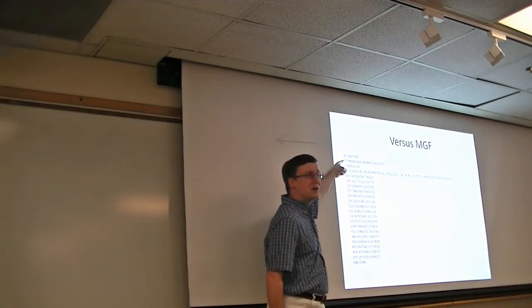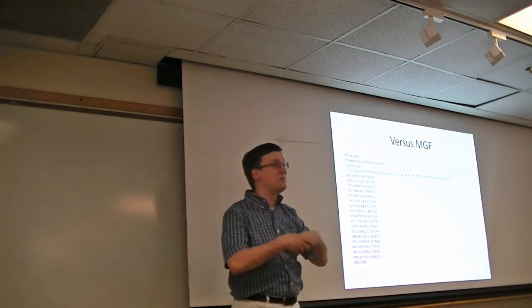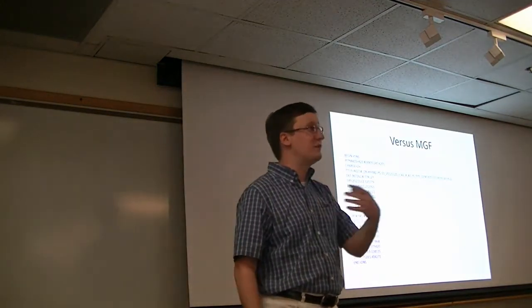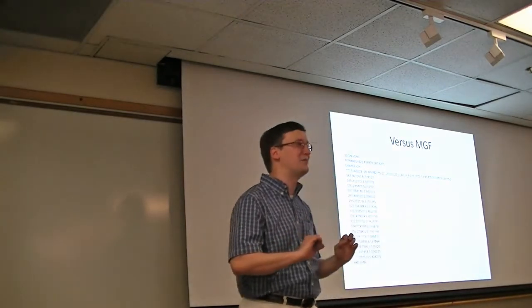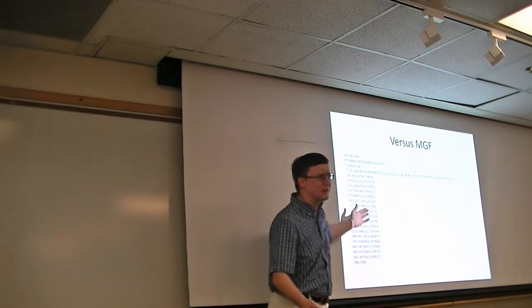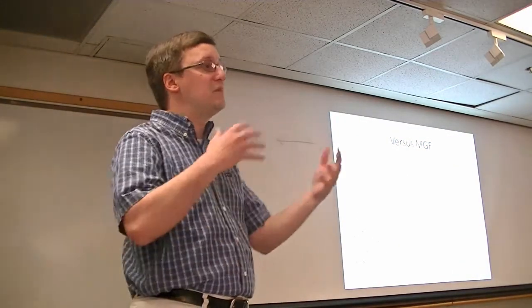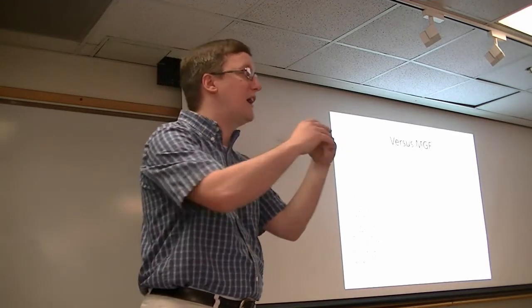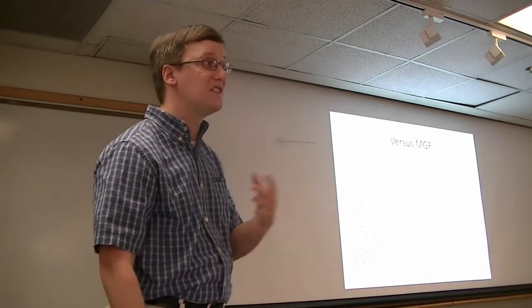We have something to demarcate the beginning of a spectrum, BEGIN IONS, to specify something about the mass of the precursor. And I just want to point out that although MGF is a format that derived from proteomics, it's not immune from showing up from time to time in metabolomics. And I know it must seem offensive to some to write PEPMASS when it's not a peptide. But that's just how things are. So these are the examples of how rich a file format can be, or how sparse it can be, depending on what that format is intended to support.